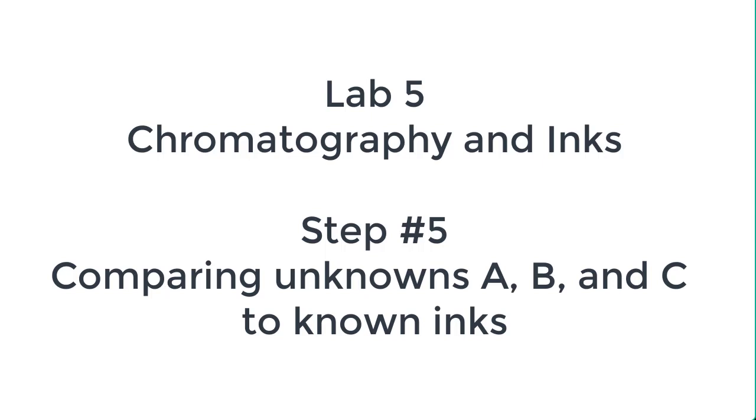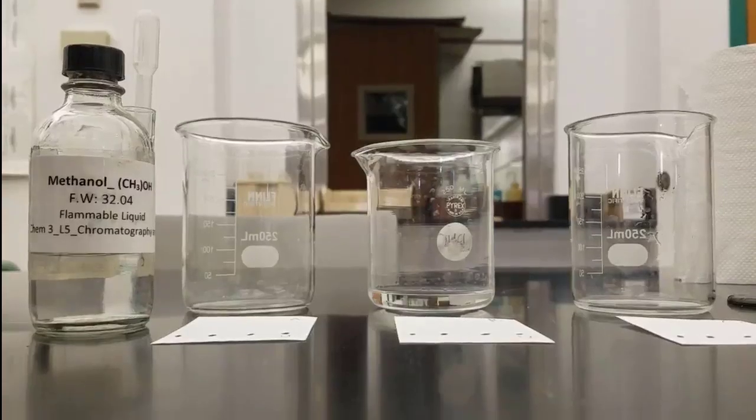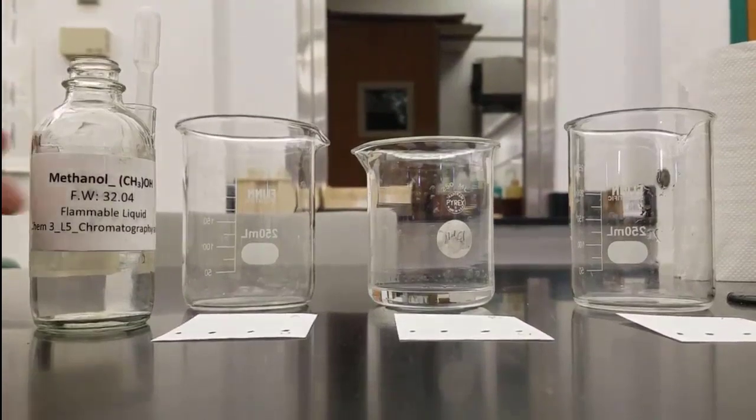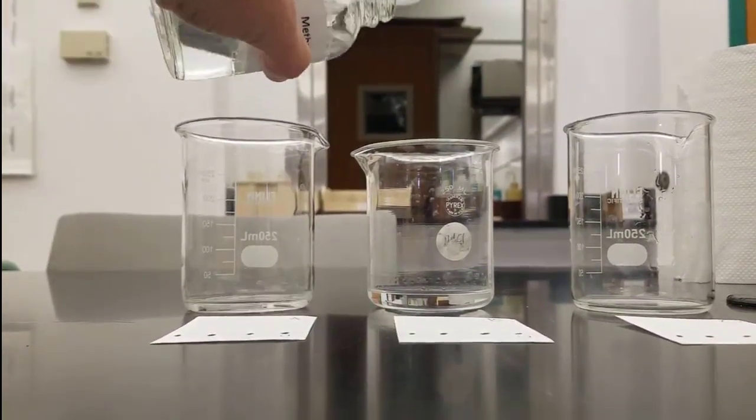Next up, we're going to do step number five. We're going to look at three different unknowns. So we have Sharpie, Crazy Art, and Crayola, and then a fourth spot now for our unknown. Those have been prepared already.